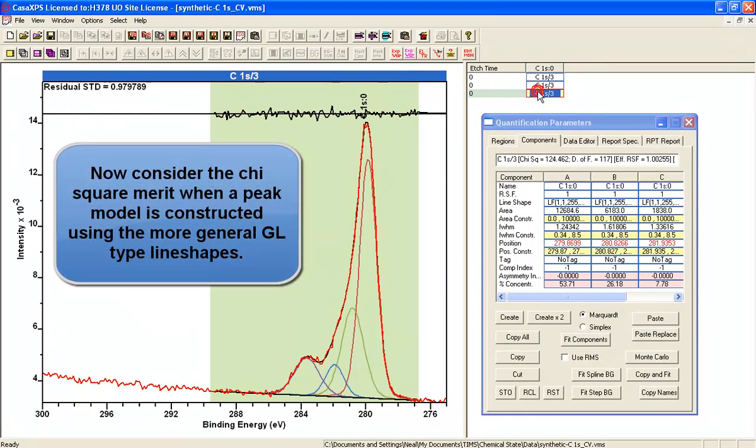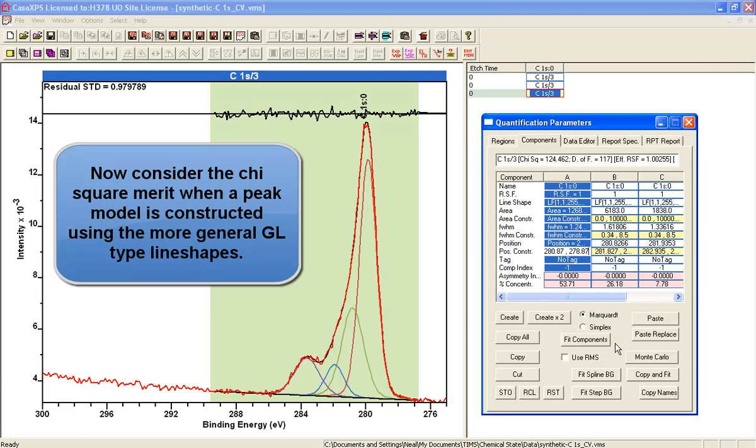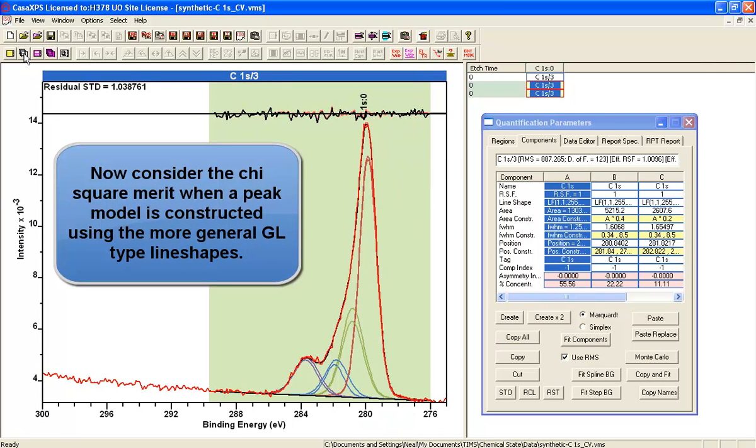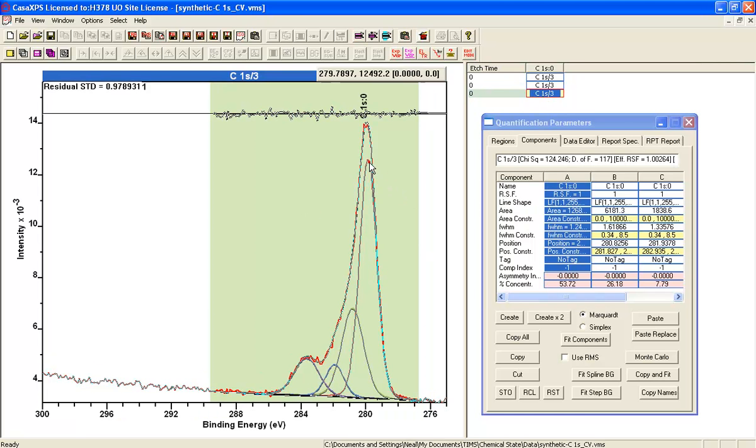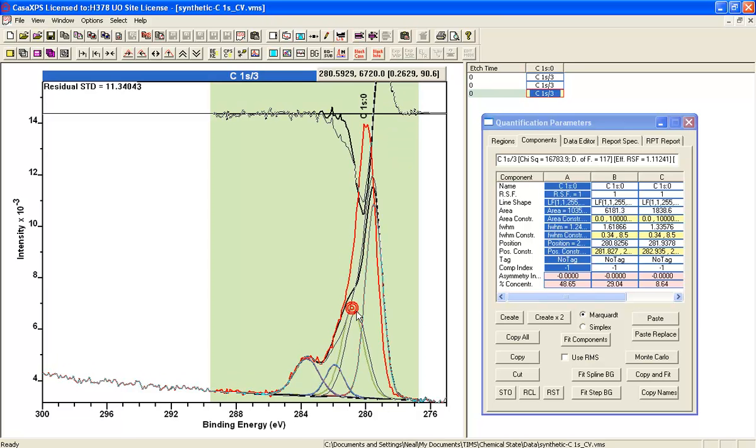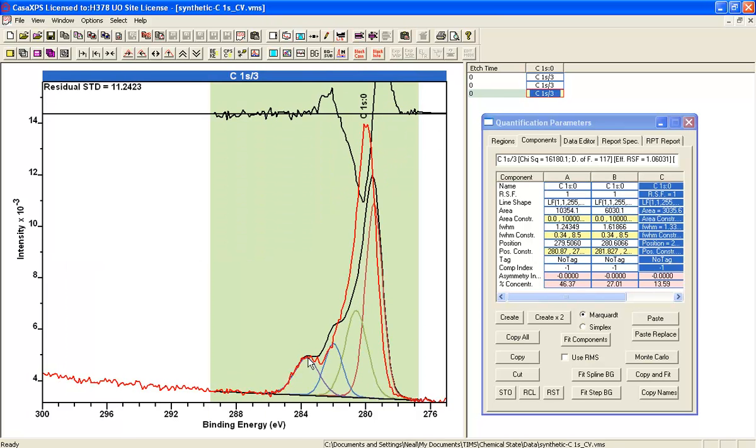So this should give you a cause for concern. And now if we set this problem up again, this time we're going to introduce not the LF line shape that was used to create the data, we're going to add a new line shape that will be a GL form. And that's not an uncommon line shape that's used in peak fitting.